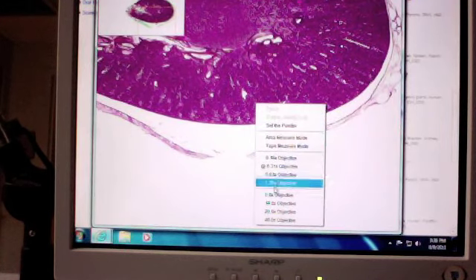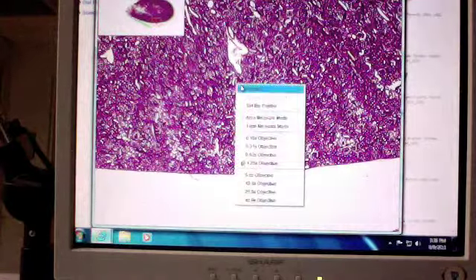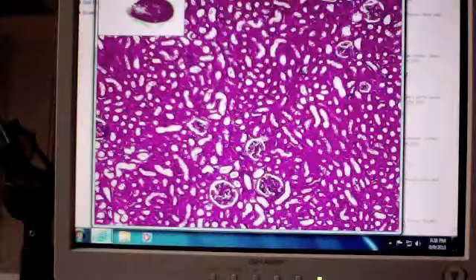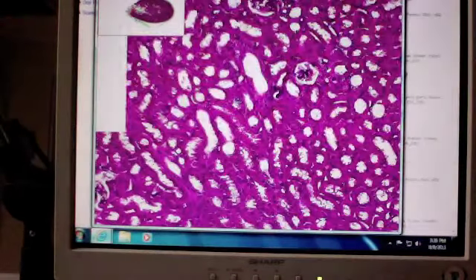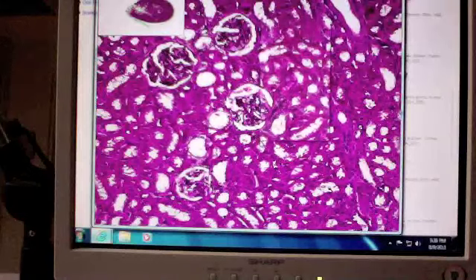So we're going to start off describing the different kinds of epithelium, and the simplest epithelium is the simple squamous epithelium. And we've told you that probably the easiest example to look at initially is found in the glomerulus of the kidney.